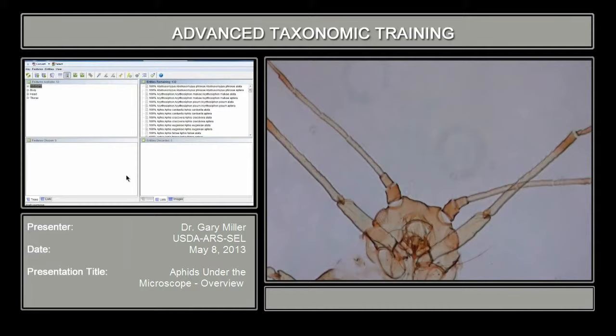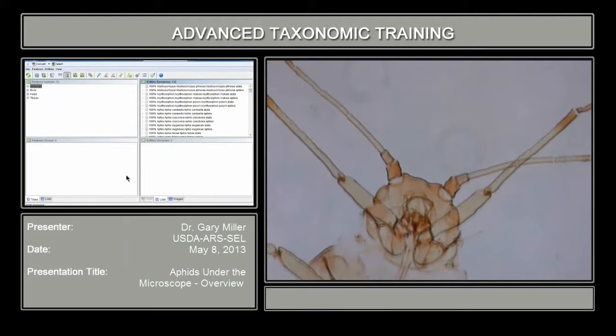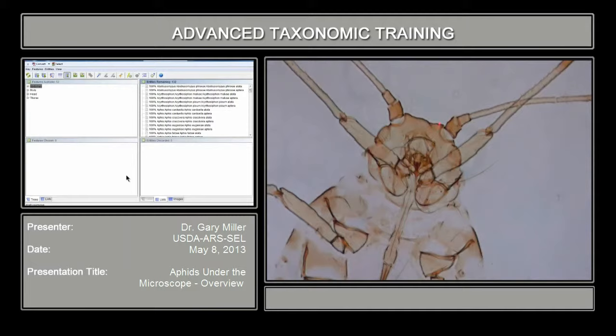Looking at the head, getting closer down towards the head region, there's a structure called the antennal tubercle — this area right in here. I'm starting out with a specimen that doesn't have much of an antennal tubercle, so when you look at this particular specimen in a key, it'll show whether the antennal tubercle is absent or present. We're going to look at a specimen of Myzus persicae in a little bit that has very well-developed antennal tubercles, but here the antennal tubercles are not much higher than the frons, which is this area right here in the center — a critical structure to evaluate.